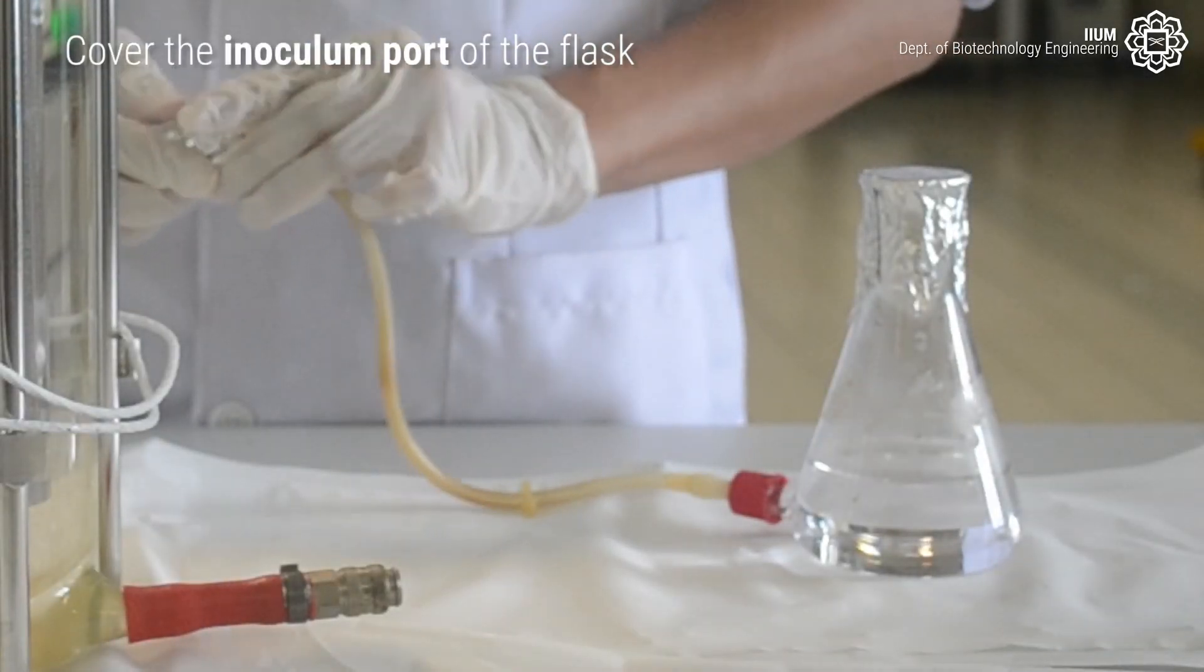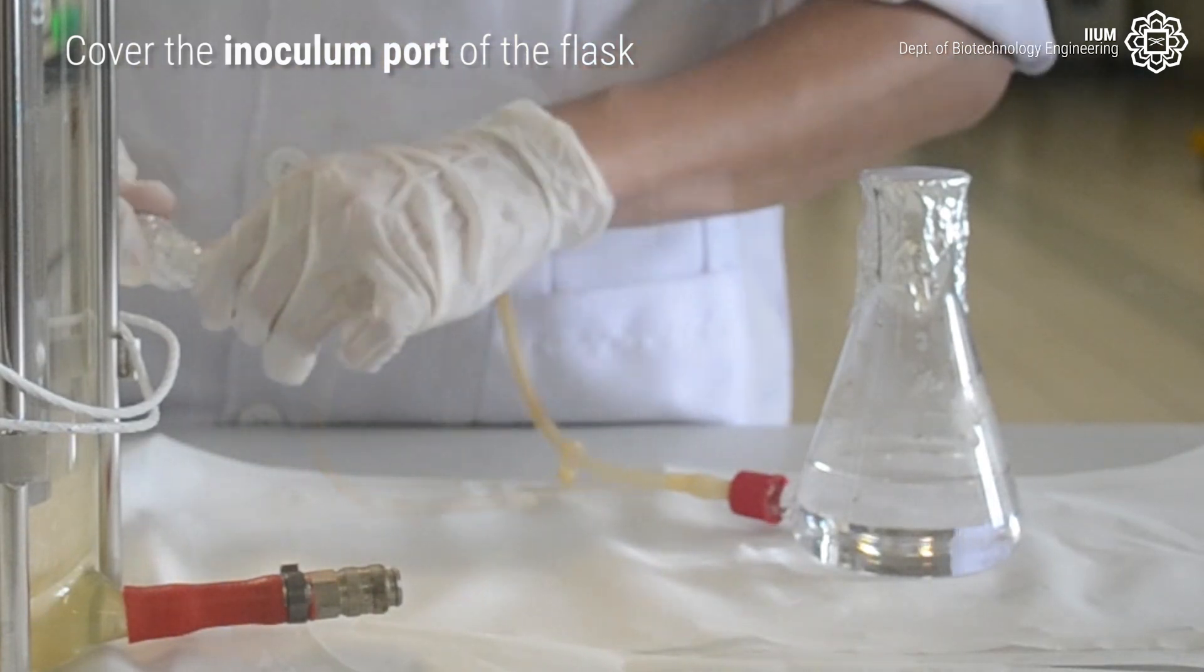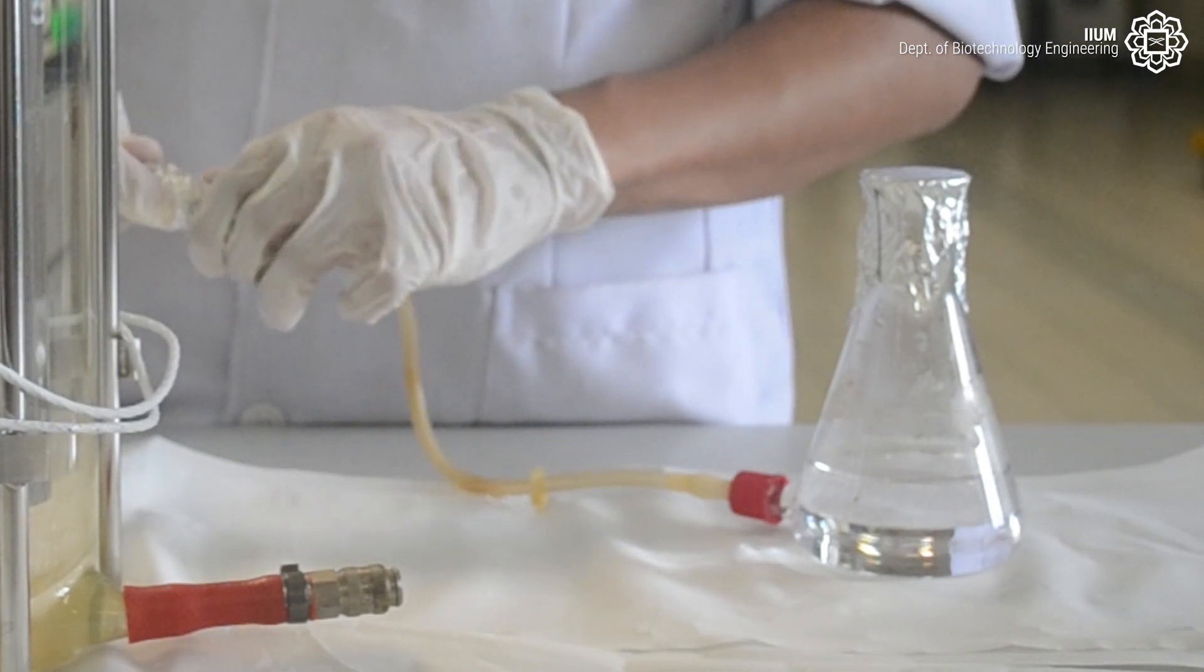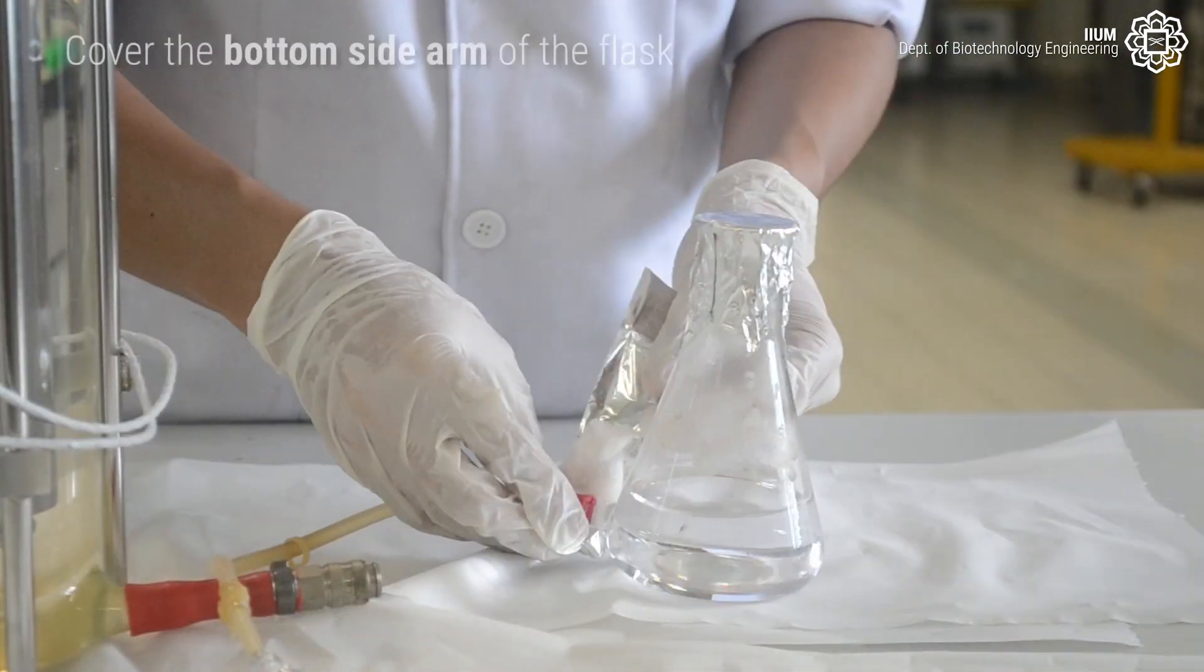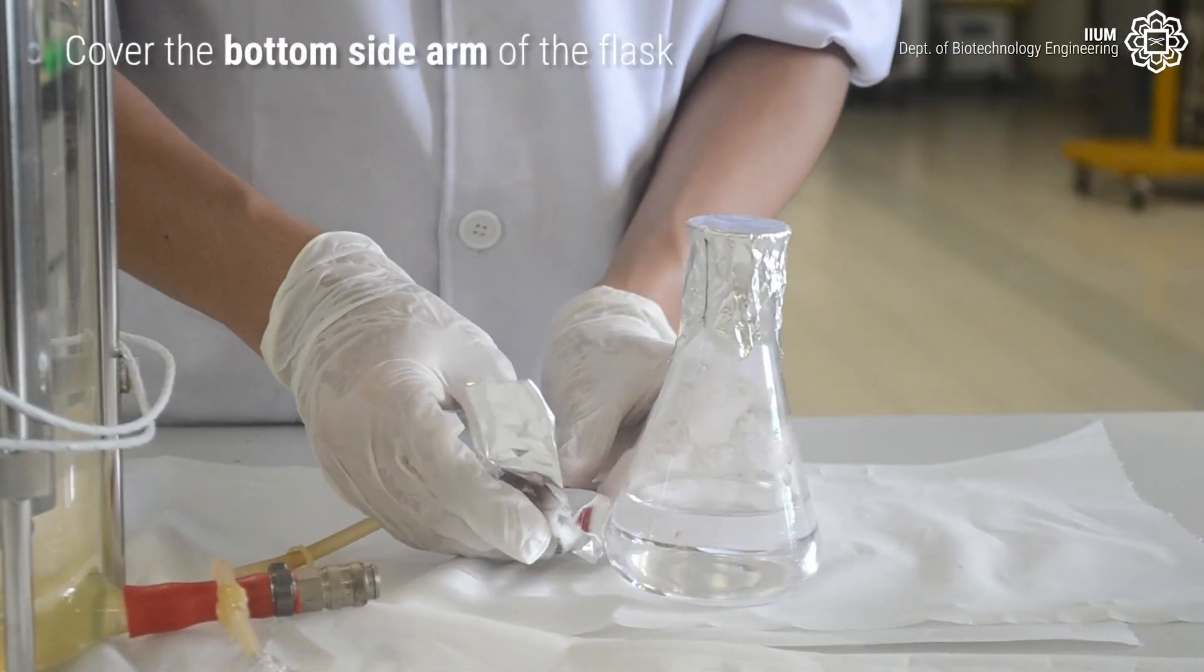First, cover the inoculum port of the flask. After that, cover the bottom sidearm.